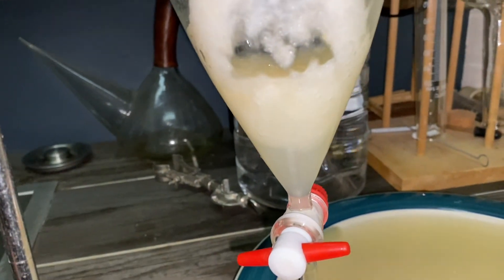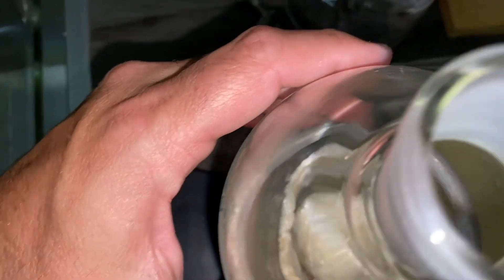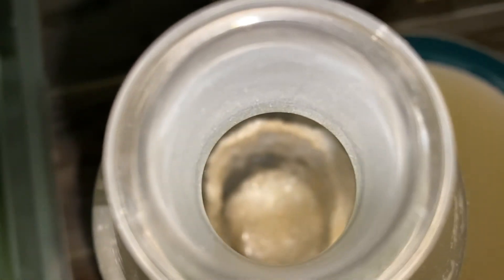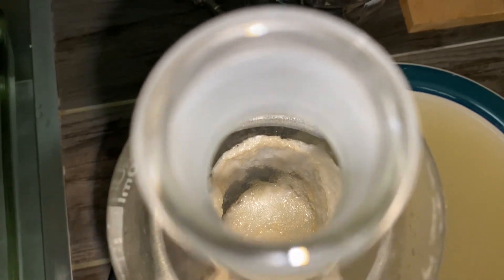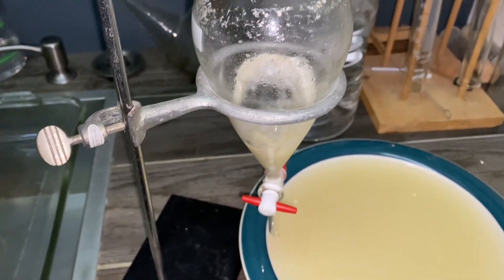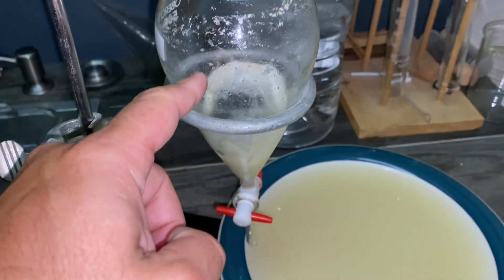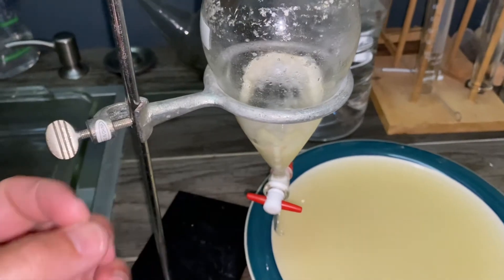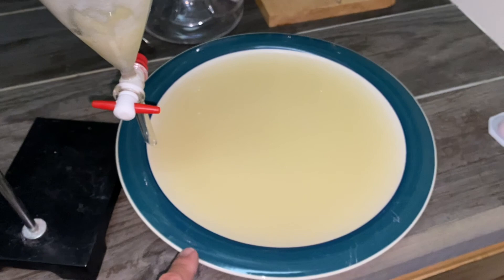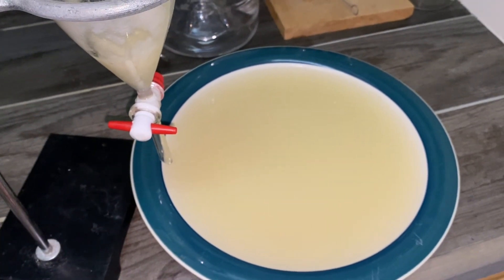I'm going to separate the two different kinds of fluid. There's our CBG, and probably the best way to get that out of there is to rinse it through either with distilled water or alcohol. I'm going to try rinsing this out with a little alcohol — it may dissolve some of it, but then it should recrystallize as it dries out over time. Then we'll dry out the water-soluble substances and see if anything comes out there.